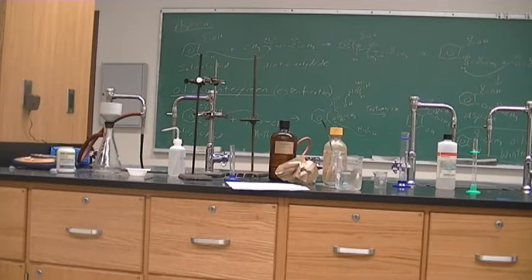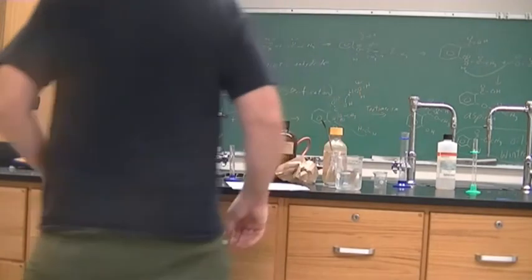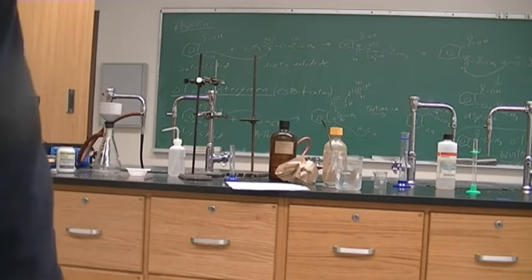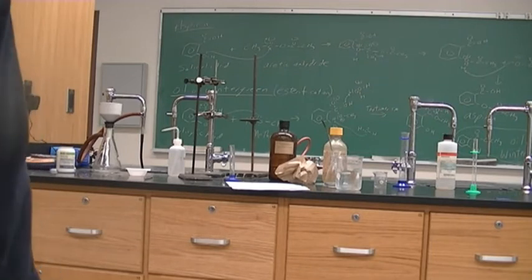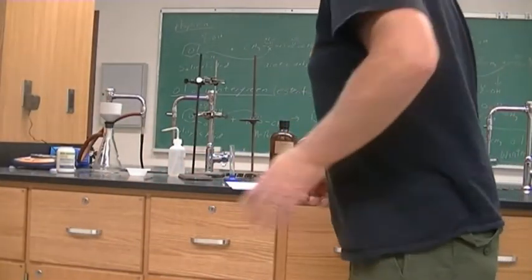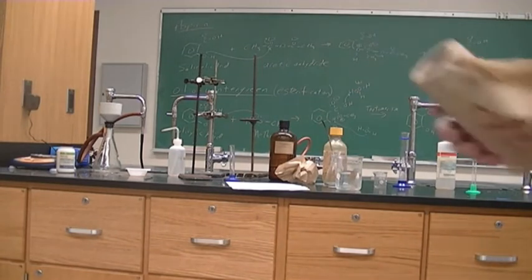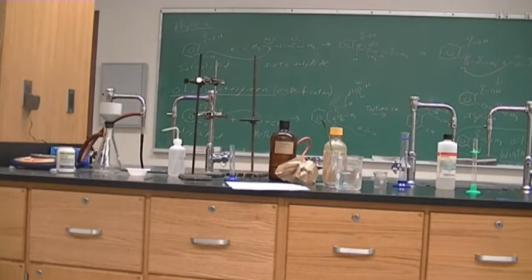Turn off our boiling water. You can see that it is still going through there. Now, if we want to make sure that we have aspirin, you would get a melting point of this solid. It doesn't ask for a melting point, so we won't. Normally, once you have your solid, after it is dry, you get a melting point.